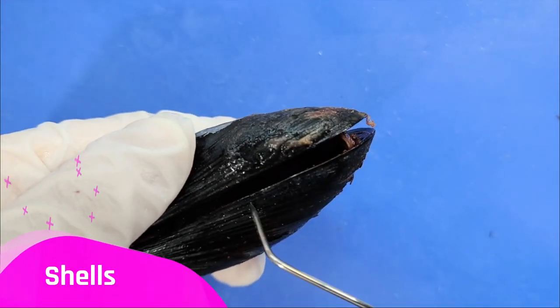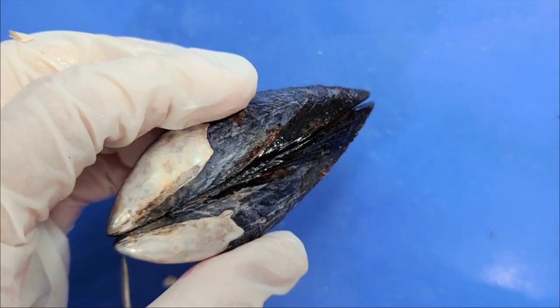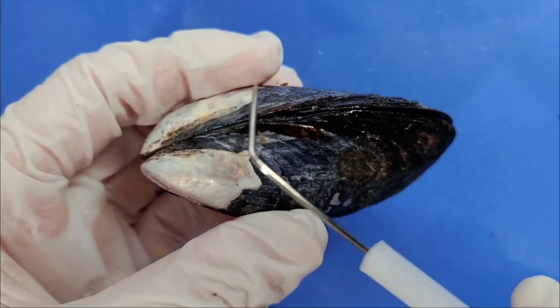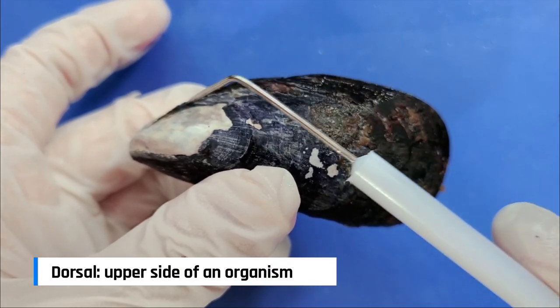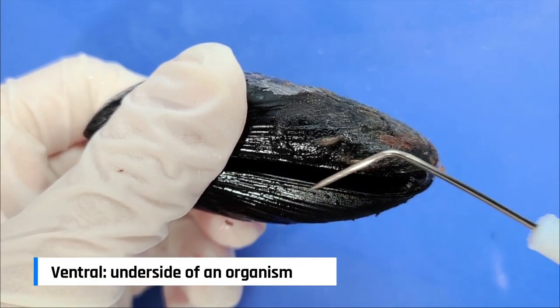So these are the two shells and the hinge connects them here. Now let's orient the mussel. The hinge area here is actually the top or the dorsal side, while the opening here is the bottom or the ventral side.